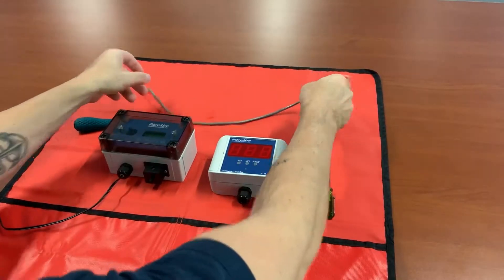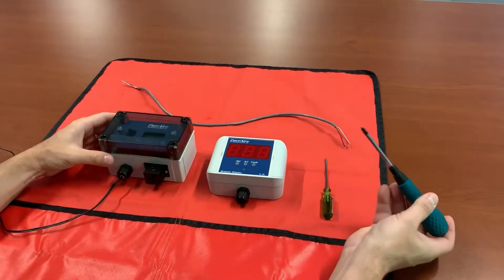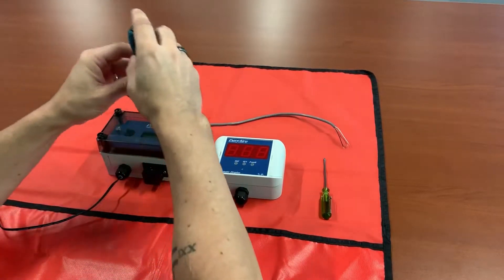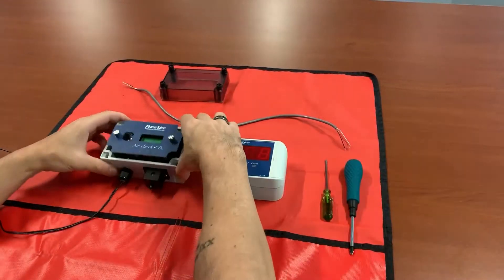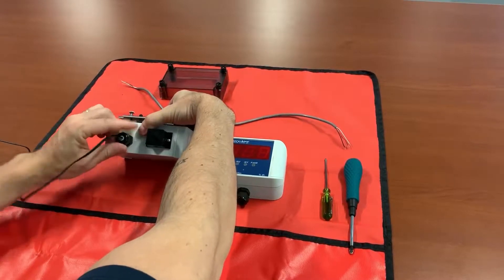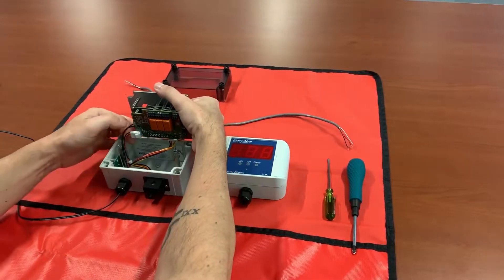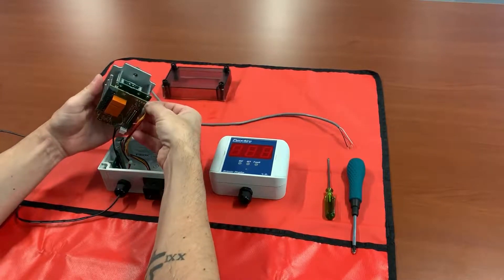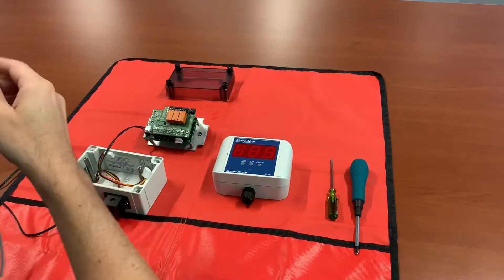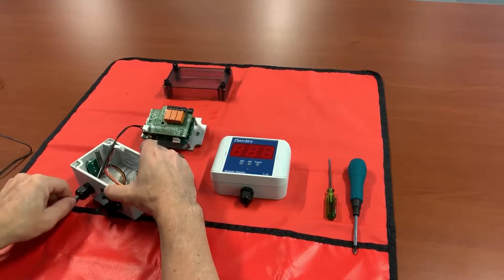First thing you want to do is ensure that you do not have power applied — you don't want to short something out or blow a fuse. Go ahead and remove the protective enclosure cover so you can access the electronics. There are two silver captive screws. Loosen the cord grip on the bottom and kind of pull it out, but don't pull too far — you have to disconnect your horn. This connector on the left is your O2 cell. That should give you plenty of room to pull your electronics out and work. Then take your hookup cable and run it through the cord grip, just to give you an idea of how that's going to look.